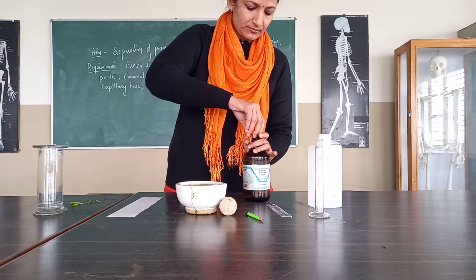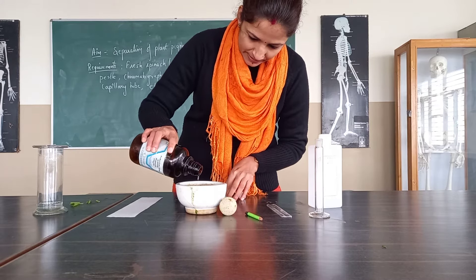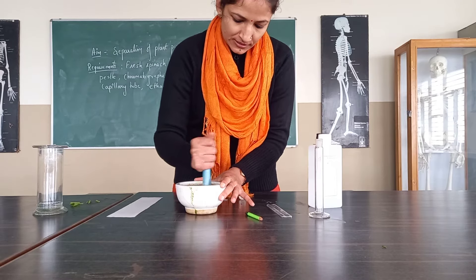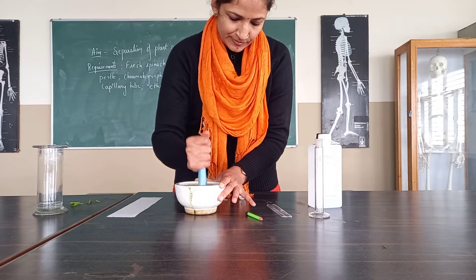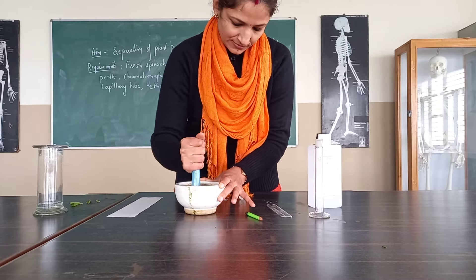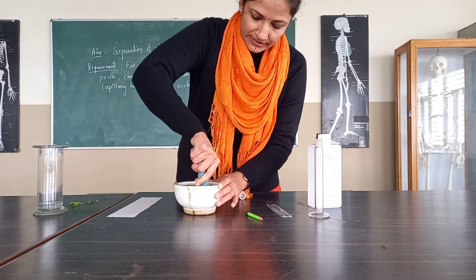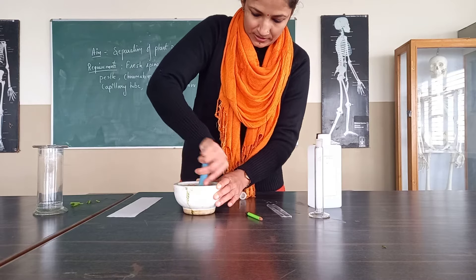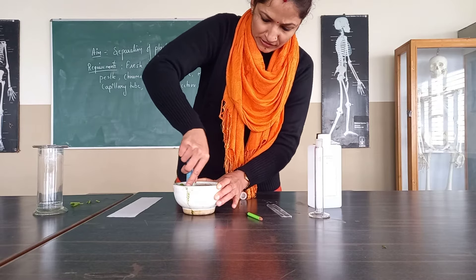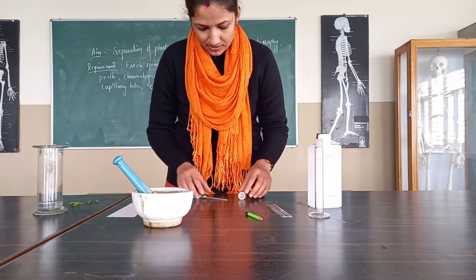Now we will grind this. For better grinding, we can add sand also. We will take out the extract of it. After grinding, we have finally converted that into a paste.